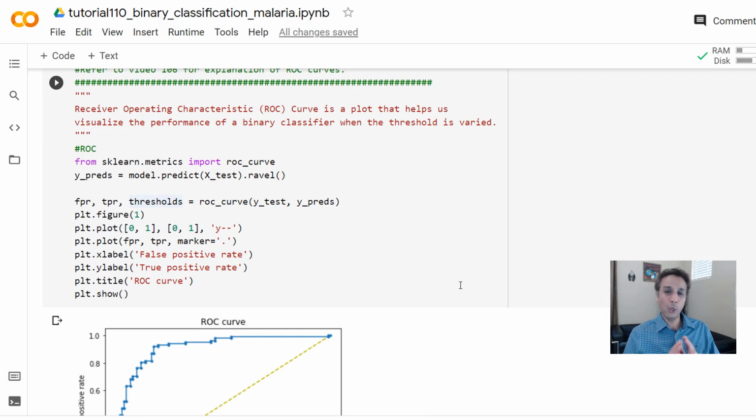I hope now you understand binary classification. Most examples, you can follow this. Let's say you are getting a whole bunch of images from your microscope. Some are good, some are bad, what you think as bad. And you're like, hey, I don't want this. I want to build a filter for my image analysis pipeline where I filter out the bad ones automatically and only the good ones go through, right? So that's a binary classifier you're trying to build, good versus bad. Just train it on a whole bunch of what you think are good images and bad images, and it usually does a great job, like 95+% in terms of sorting these images. And we have done that. That's why I'm mentioning that application to you.